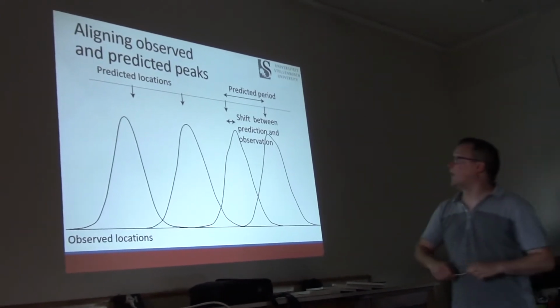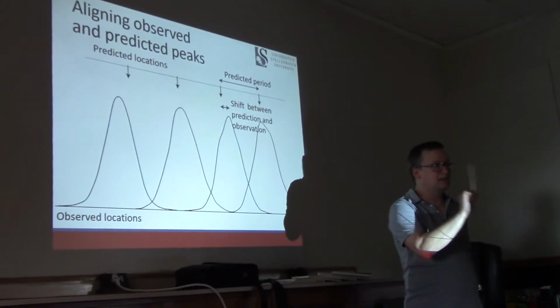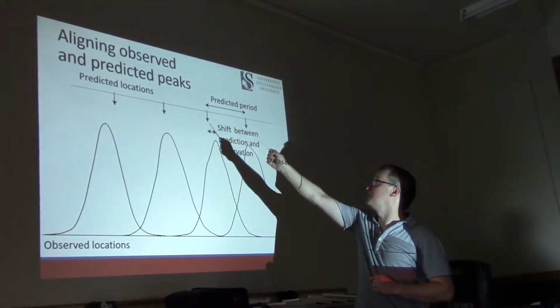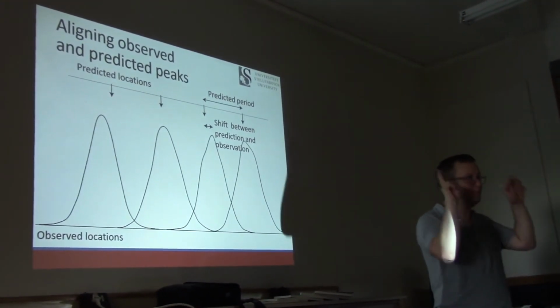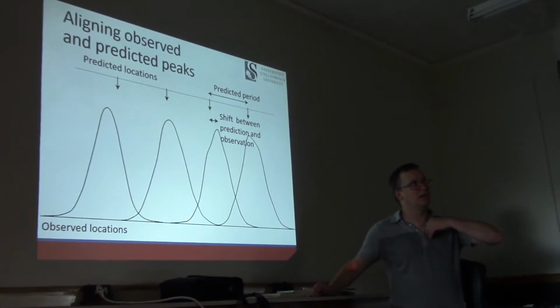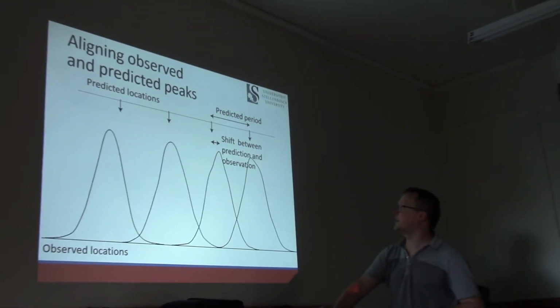Okay. Now, let us imagine that the Fourier transform has given us an expected rate at which new nucleotides are appearing. That appears along this numbered timeline at the top. Predicted location, predicted location, predicted location, predicted location. The period, the time between beats on our electropherogram, is what's fallen out of the FT of the electropherogram as the key rhythm at which new nucleotides are coming.